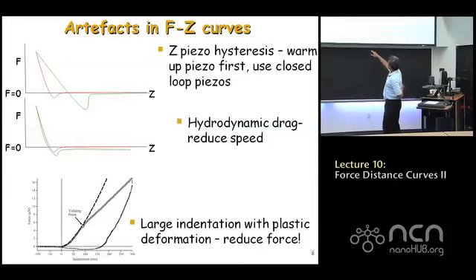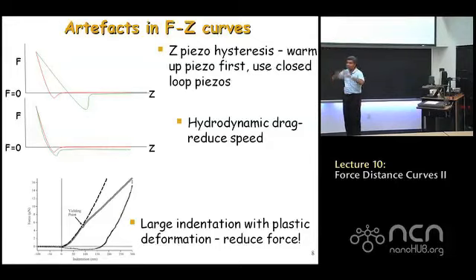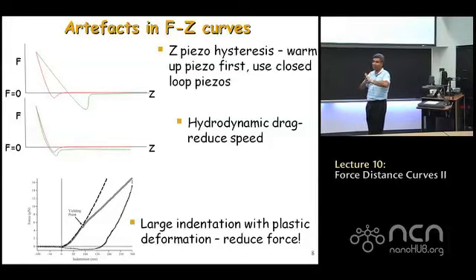So this is an example. So as soon as you see this, you look at the force, micronewtons. As soon as you see someone plotting micronewtons, you should just get up and red flag should come off, and you should say, oh my goodness, this is crazy. You're applying super huge forces. Things are deforming, breaking, all kinds of stuff. And in this case, it is intentional.